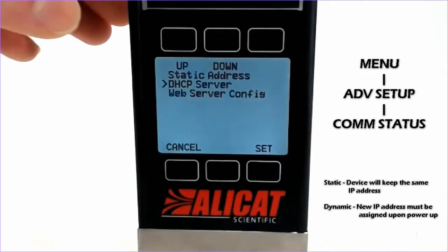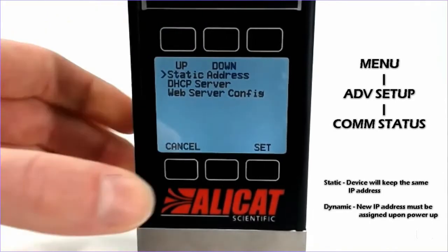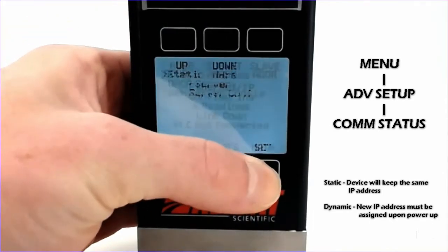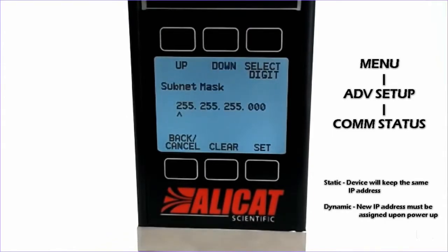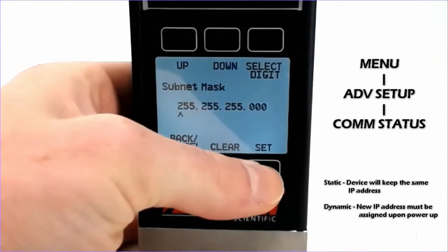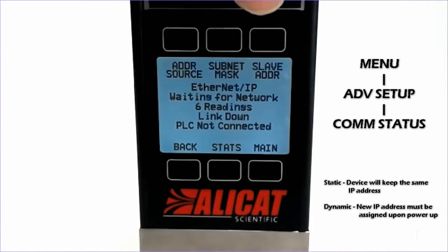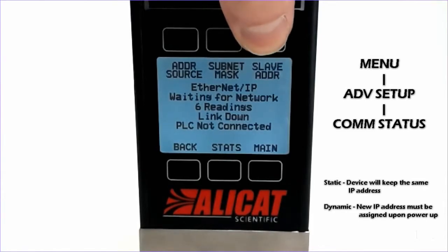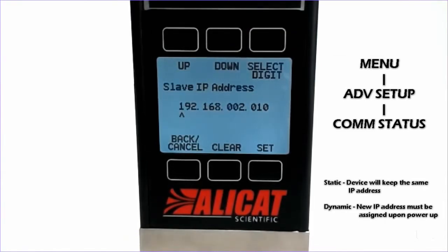If we first start with static address, hit Set. We can define a subnet mask at the top here and confirm that. And then we can assign a static IP address, and we will hit Set.